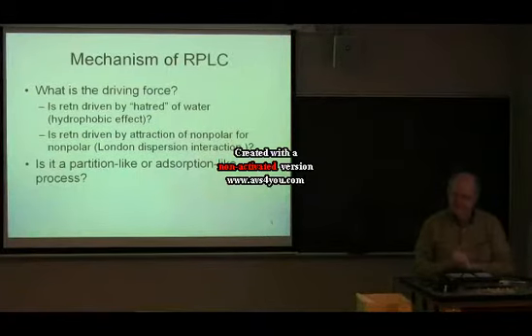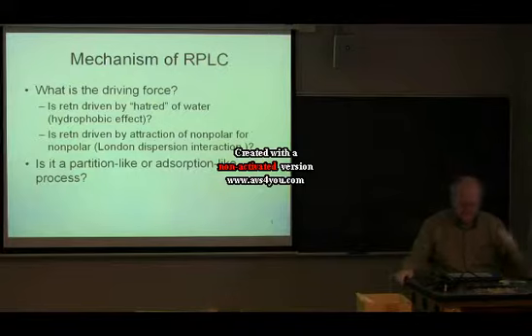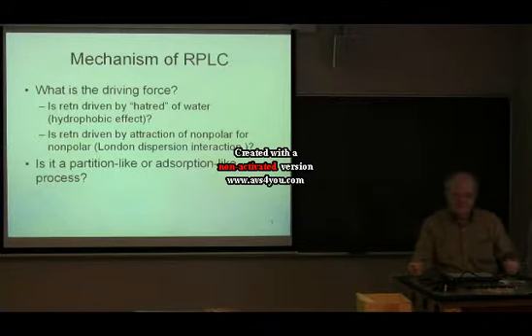So we're going to do two things tonight, I hope. I went through 3 lectures on the facts of life of reverse phase liquid chromatography, what you need to know to do it. What we're going to talk about tonight is why some of those facts are true. What is the mechanism of reverse phase LC?